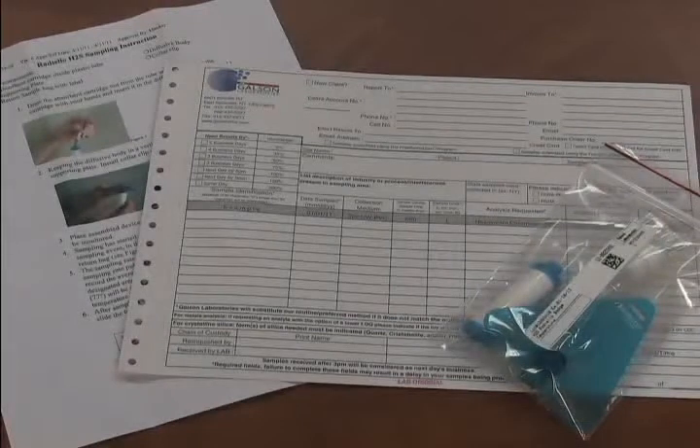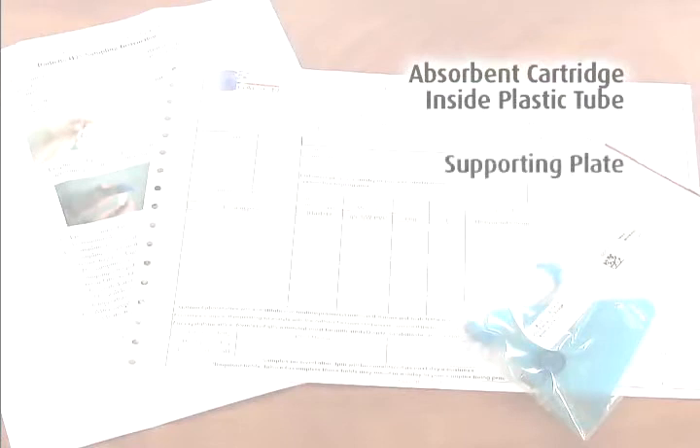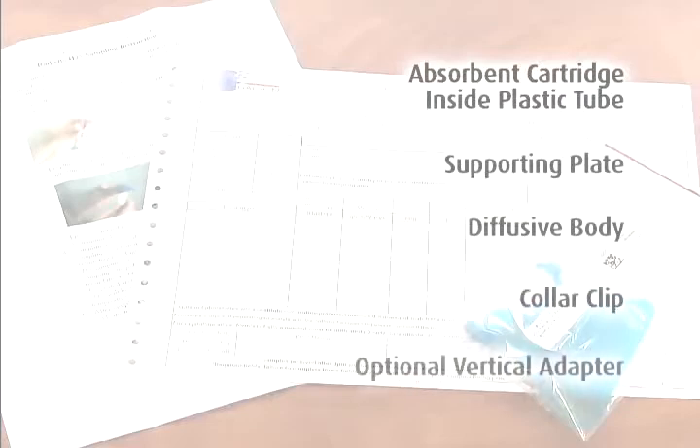Review your order to ensure you have all the components for sampling with Radiello passive monitors. You should have received the correct quantity of these for each sample: absorbent cartridge inside plastic tube, supporting plate, diffusive body, collar clip, and optional vertical adapter.